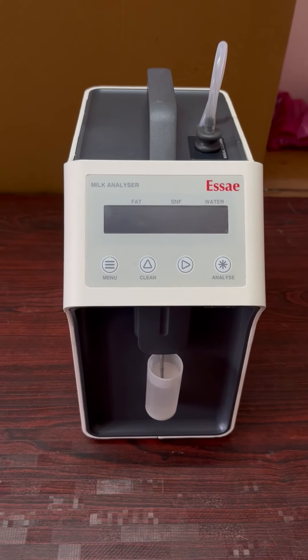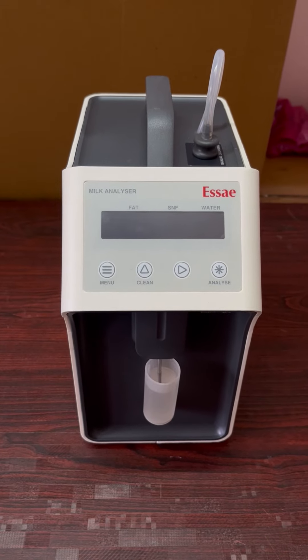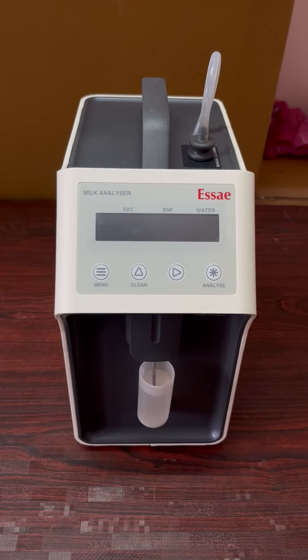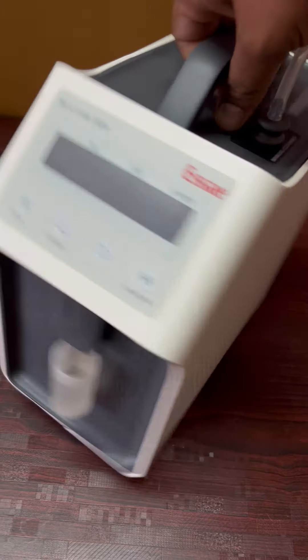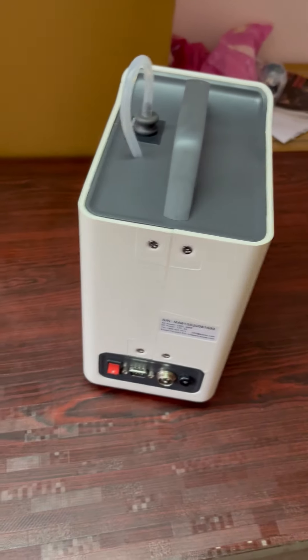This is the Essae milk analyzer MA815 ABS body. This is the with the battery. This is the power card and everything.